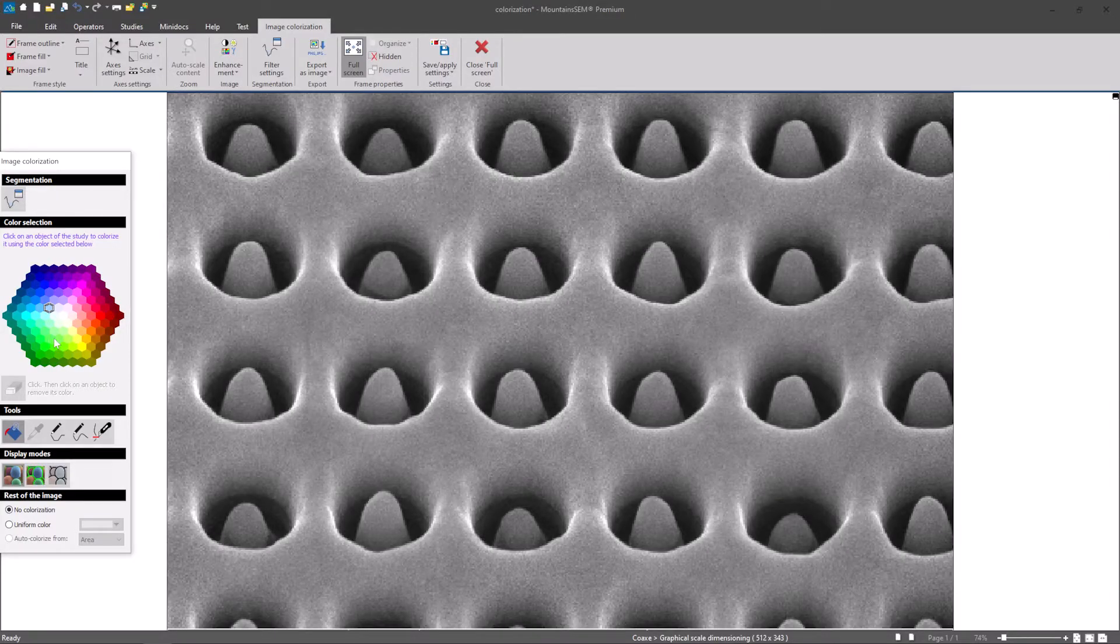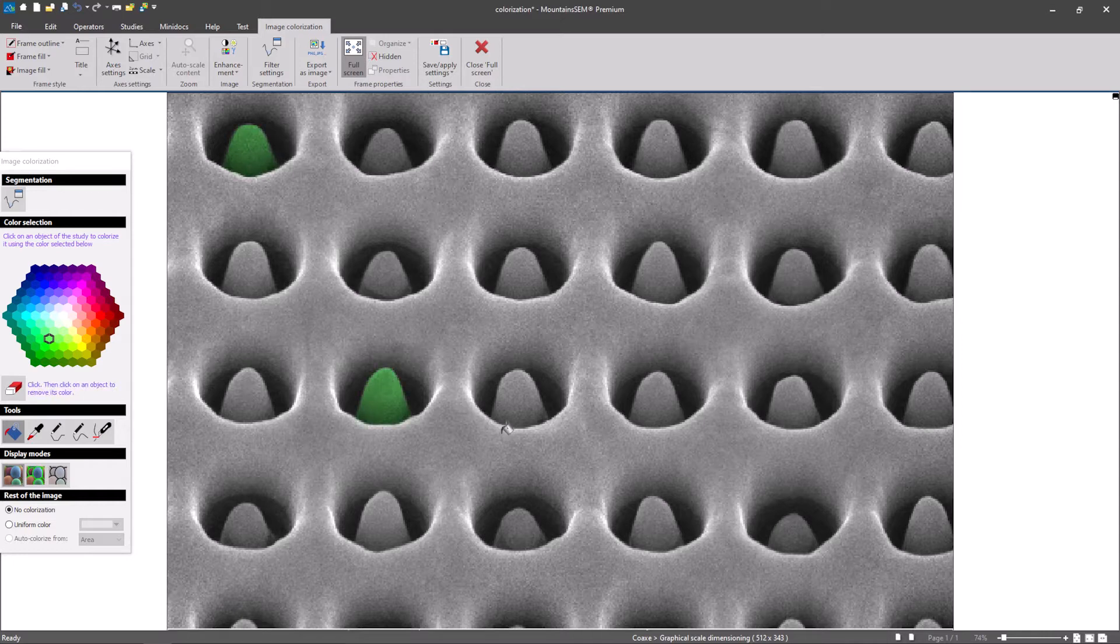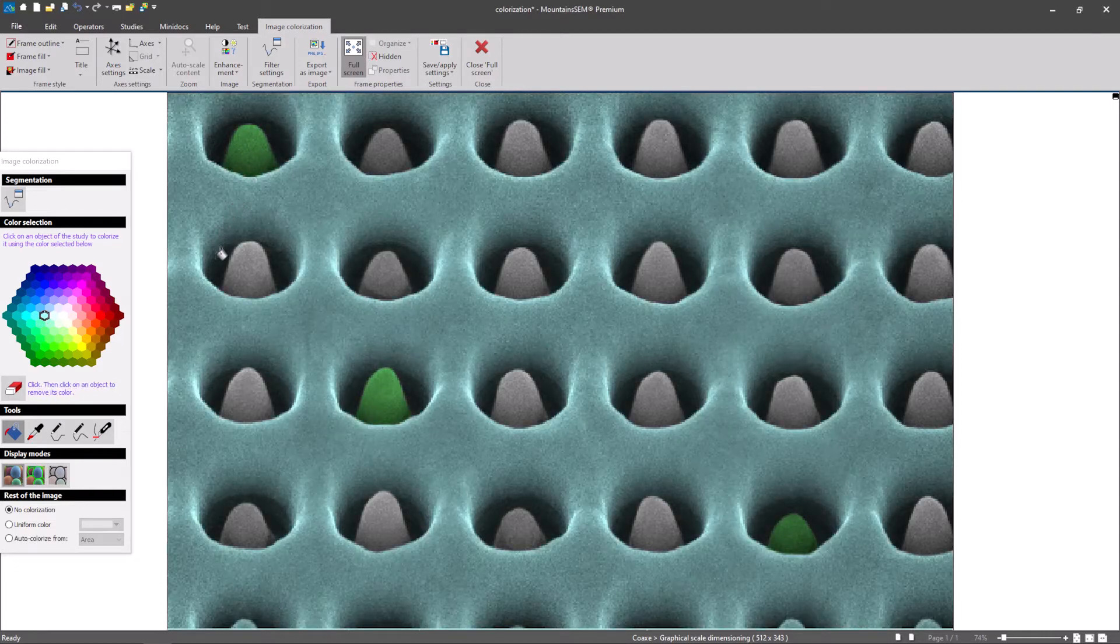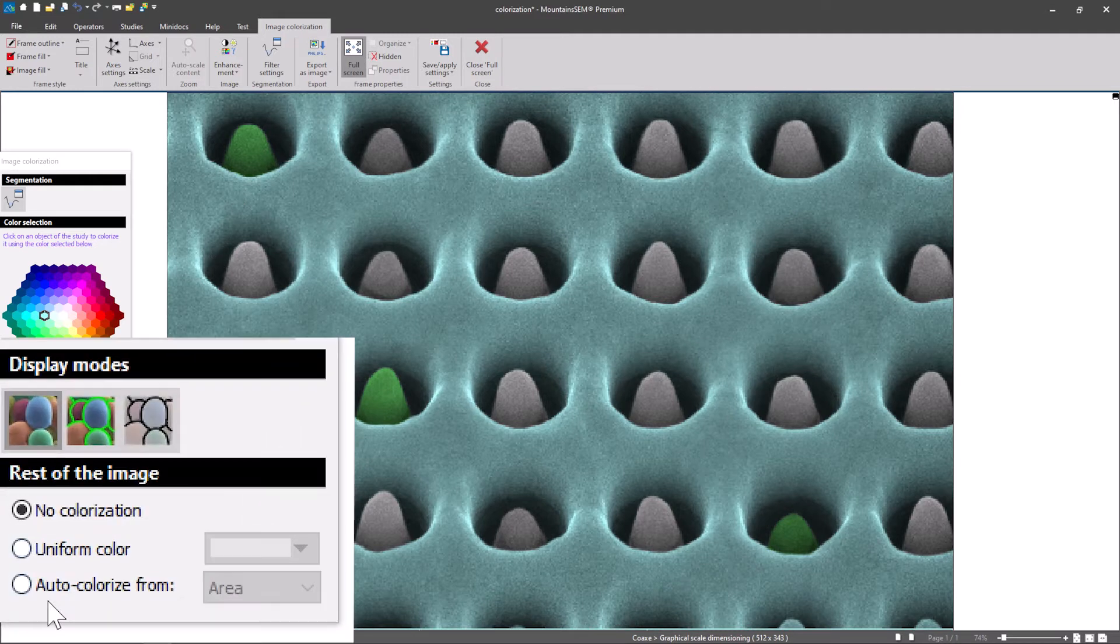All you need to do now is click on a color and apply it directly to any object in the image. Once you have assigned colors to a few different objects, you can let Mountains do the rest.